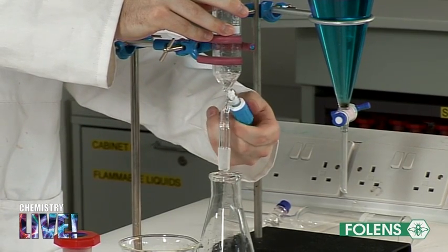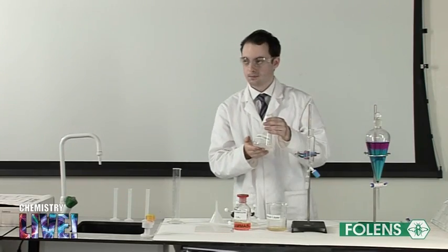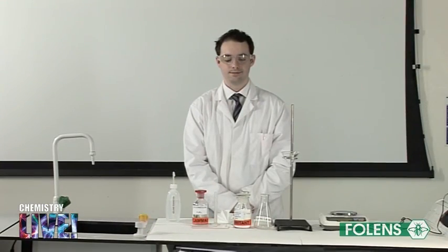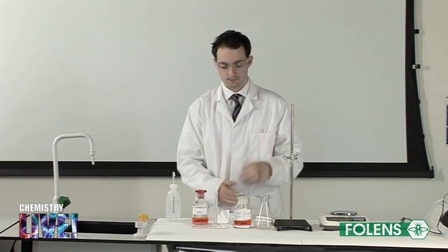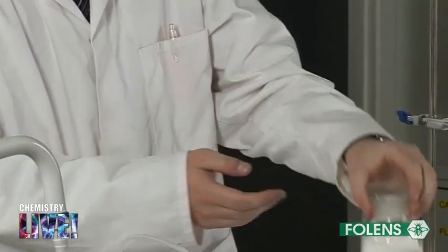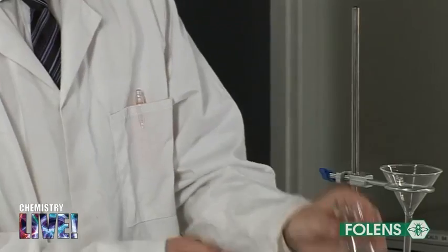This conical flask now contains 30 cm³ of cyclohexane containing the oil of cloves dissolved in it, plus some water that has come out of the separating funnel when the cyclohexane was being transferred from the separating funnel. This water must now be removed by adding anhydrous magnesium sulfate, which absorbs water. Anhydrous magnesium sulfate is called a drying agent.